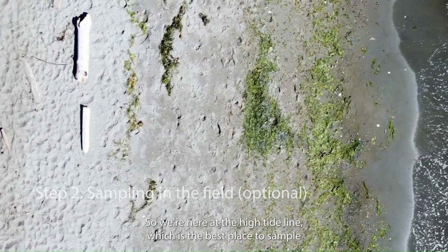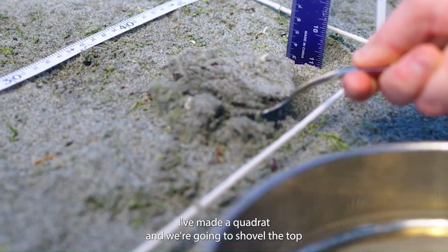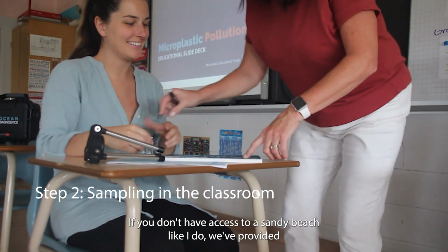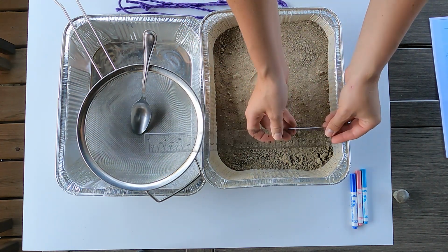So we're here at the high tide line, which is the best place to sample for microplastics. I've made a quadrat, and we're going to shovel the top 2 centimeters of sand into our sieve so that we can extract microplastics. If you don't have access to a sandy beach like I do, we've provided all the instructions to be able to sample like a scientist would, but right in your classroom.